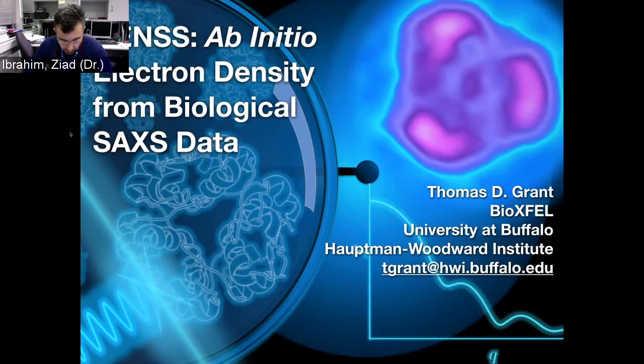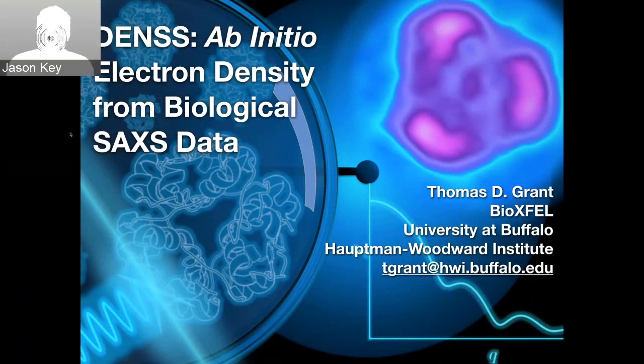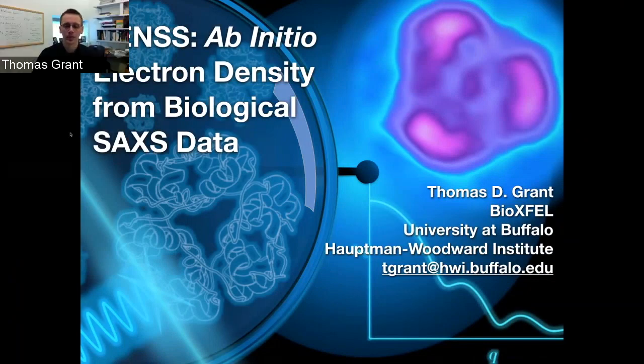Thanks, Jason, and thanks for inviting me out to give this webinar. So I'm going to divide this up into two sections, where the first part will be talking briefly about the algorithm itself and some of the theory behind it, because it works a little bit differently than some other SAXS modeling algorithms. And then after that, to understand how it works, I'll go through a little bit of a tutorial on how to actually run DENSS on your own data.